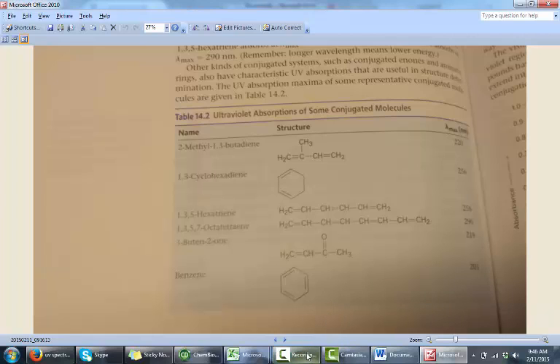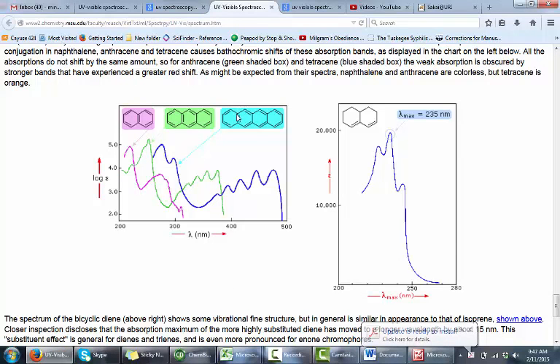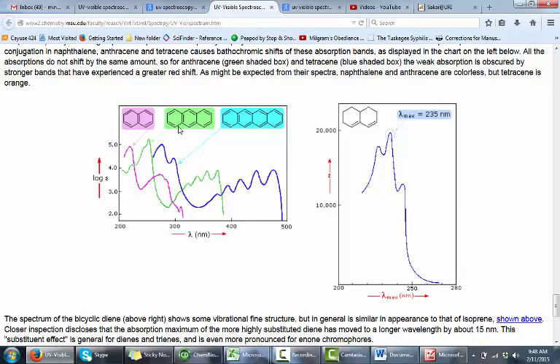So hold on one second, I'm going to pull up some conjugated systems that absorb light in the visible region of the spectrum. And here in particular what I'm showing is the UV absorptions of fused aromatic ring systems. So here's benzene, its absorption maximum, lambda max, the Greek letter lambda, is 203 nanometers. If I now put 2 benzene rings together, this is now naphthalene around 220 nanometers.